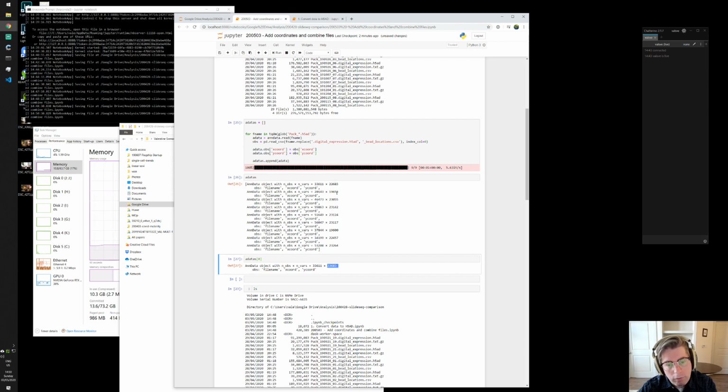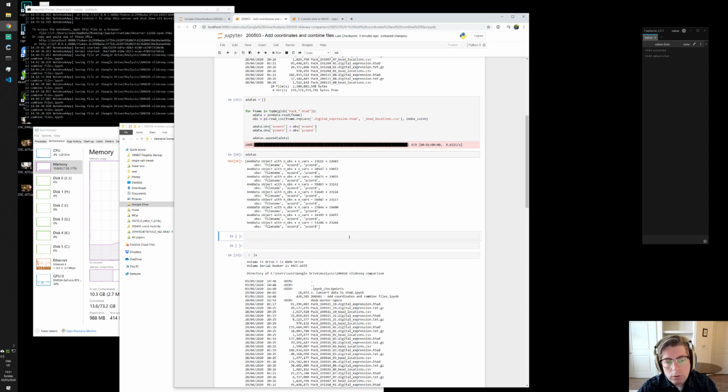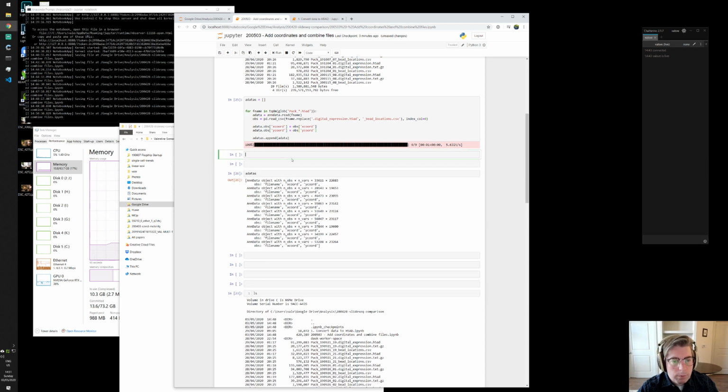We can see that the number of genes differs quite a bit between the different pucks that they have deposited data for. That's just what happens, I guess, because some of them will capture more genes than the others, and you don't want to save all of the genes that you only have 0 counts for. But what we want to do now is concatenate these.